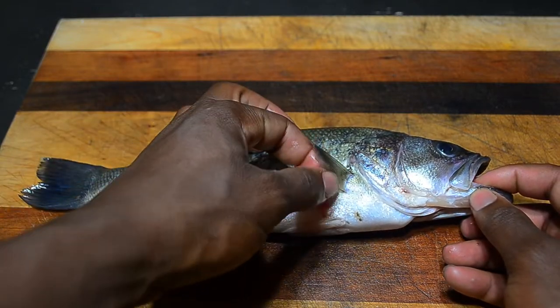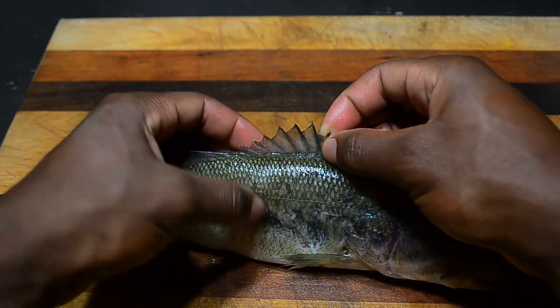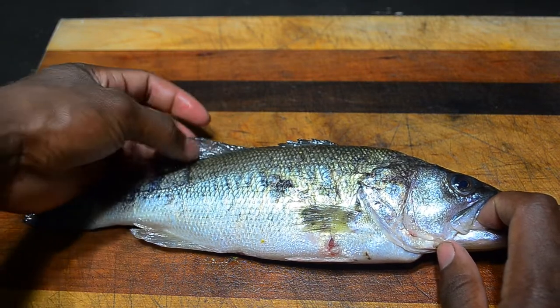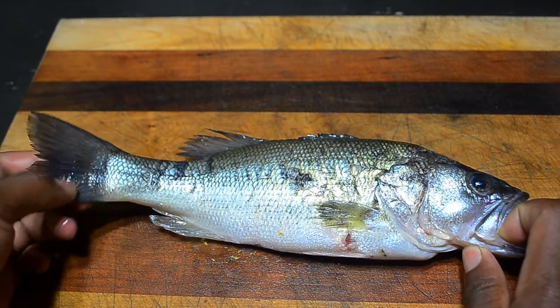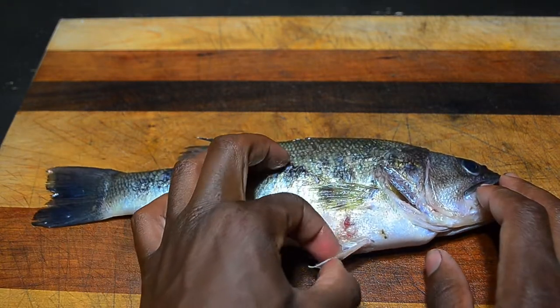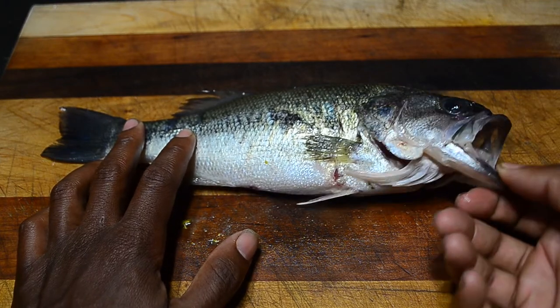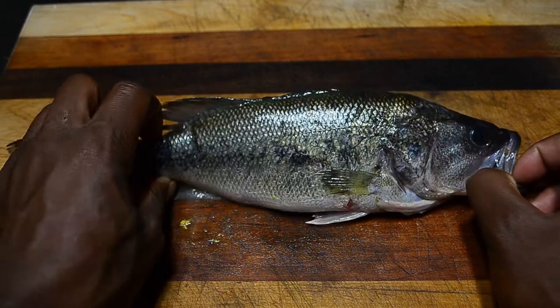They have pectoral fins and dorsal fins which do have spines — this is a common trait within the Centrarchid family. The second dorsal fin is only rays, so it has no spines. This is the tail fin, the anal fin, and the pelvic fins. In their mouths they don't have large teeth — kind of like catfish, they have very small but many teeth that feel like sandpaper.